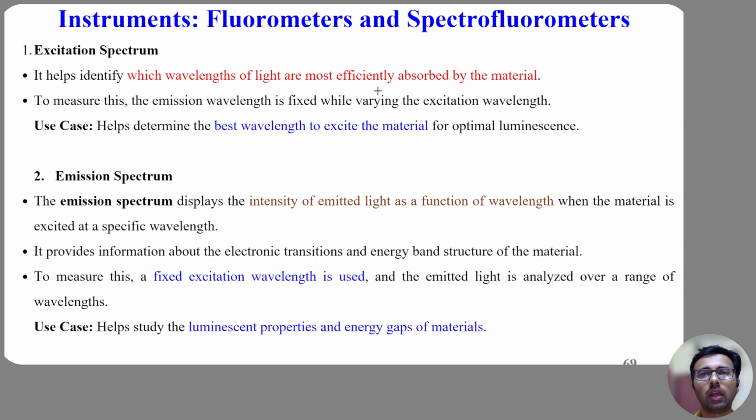After instrument correction, this curve closely resembles the visible absorption spectrum. This is extremely important. It tells us the optimal pumping wavelength for maximum luminescence efficiency.